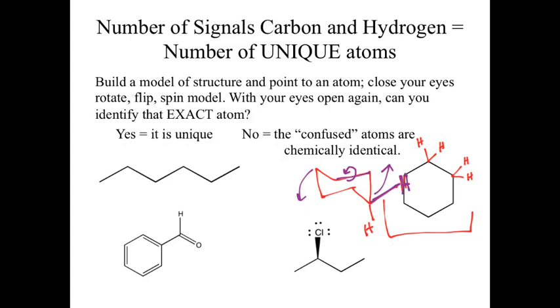So on an average, as long as we have enough thermal energy to allow that cyclohexane to move around, we would see 1 signal for our hydrogens. If, however, we freeze the sample and prevent the rotation, or the ring flipping, we end up seeing 2 hydrogens. Kind of a neat little distinction to look at there. So we can actually see the difference between our chair conformations using spectroscopy.